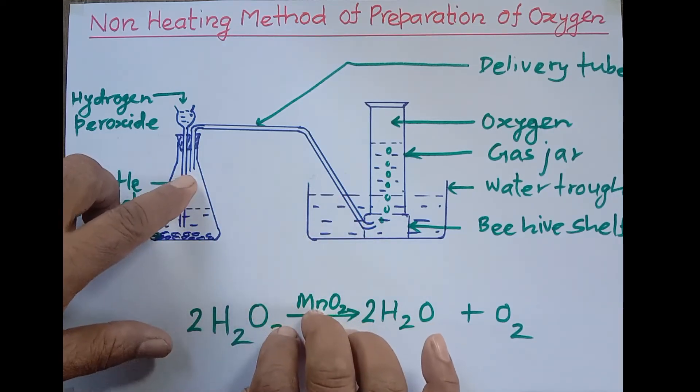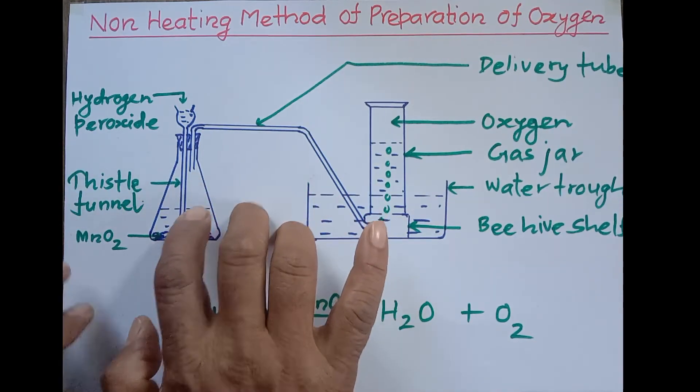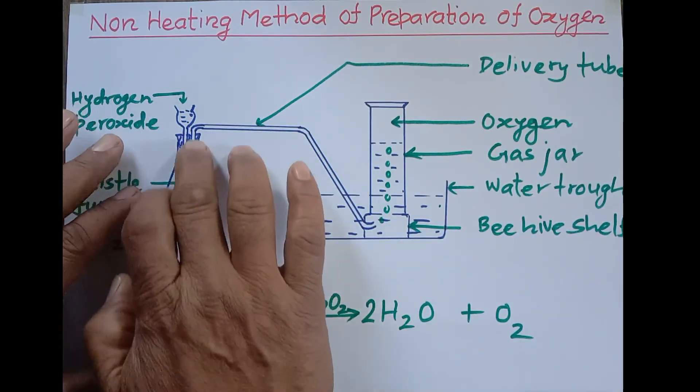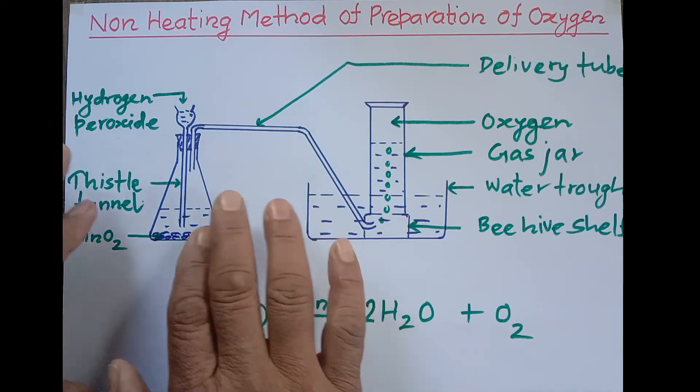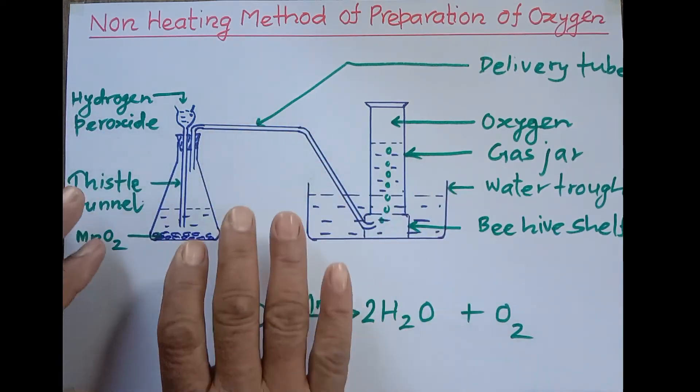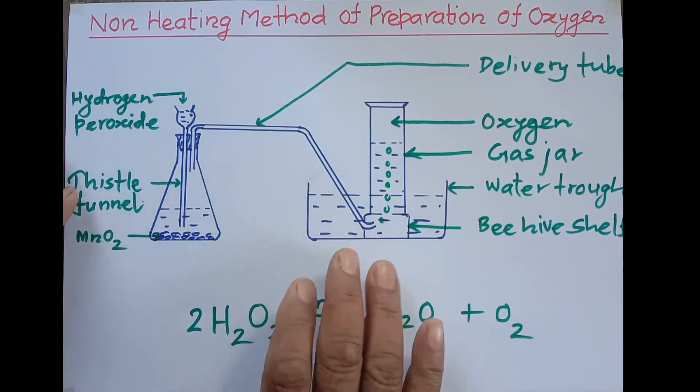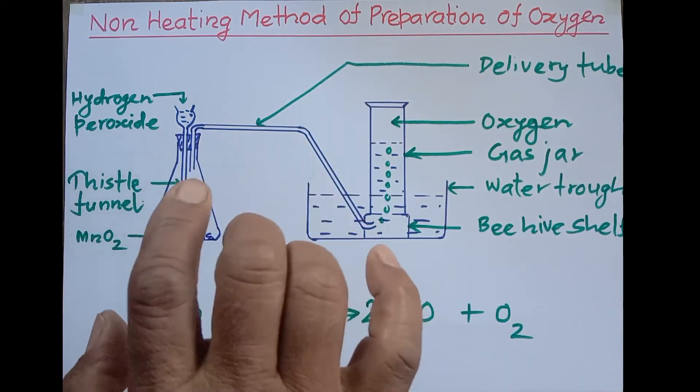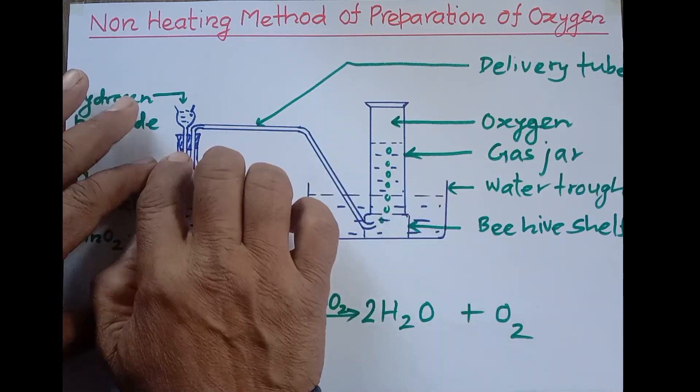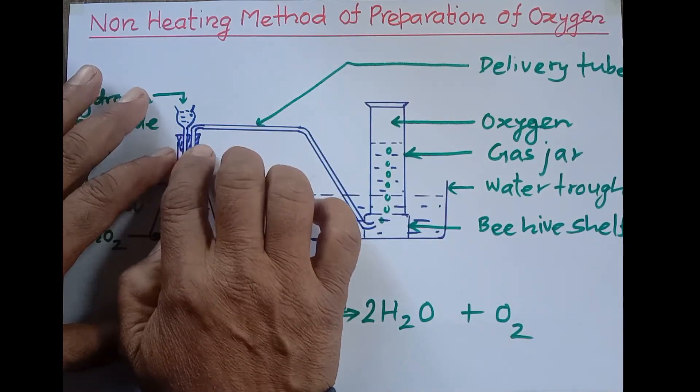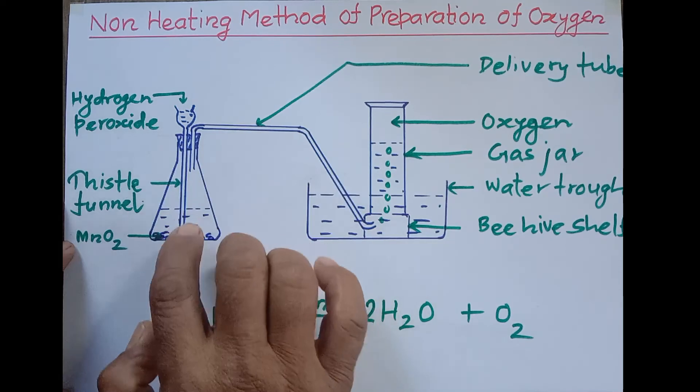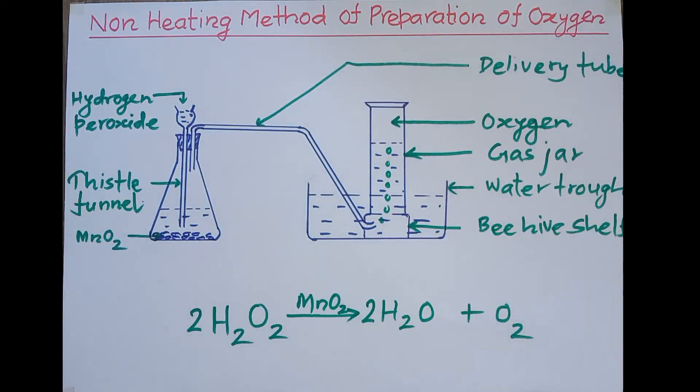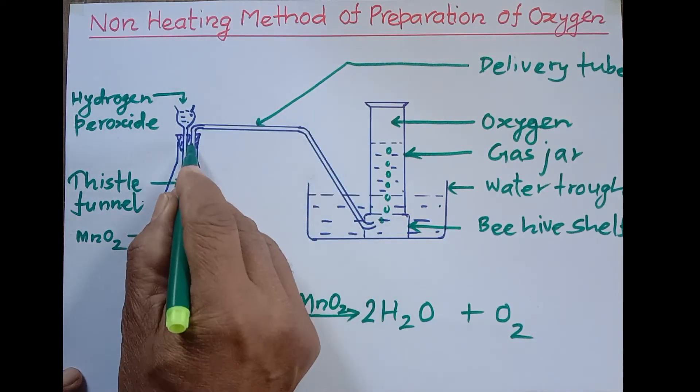Another point about this delivery tube: the tip of the delivery tube should not be deep into hydrogen peroxide, otherwise there is no way for oxygen gas to go out and that situation becomes dangerous. Also, the cork should be airtight when we fit it, otherwise the oxygen gas will go out through other gaps.